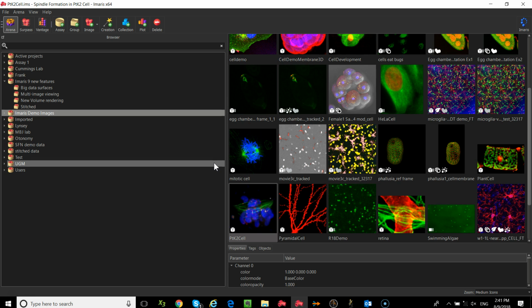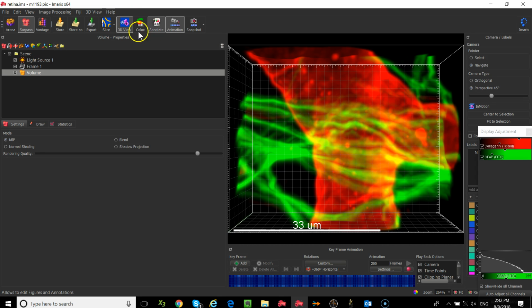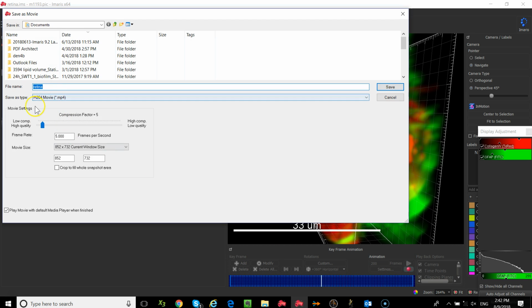Okay. Tell me how it was supposed to be again, because when I did it, it saved it as a really grainy, it wasn't like the kind of... So one thing to be aware of, I didn't save any of these as movies. Let me just do this. When you go into animation, let me just add a couple of these frames and then go in here. There's this little icon, the slider bar compression. I didn't talk about it.